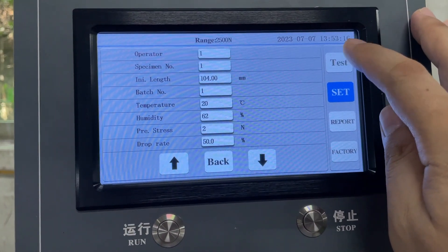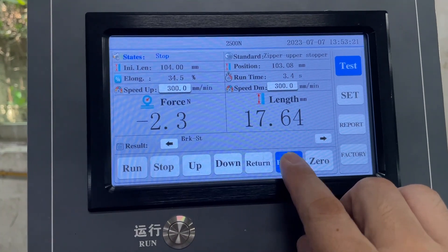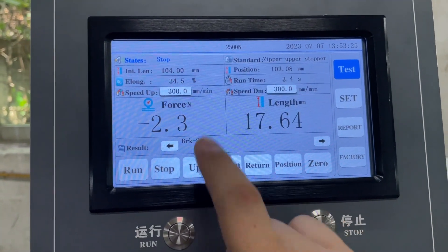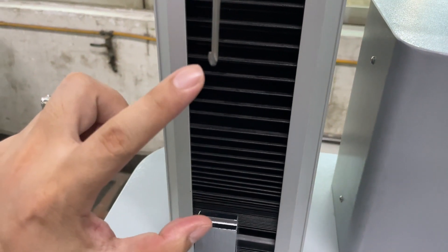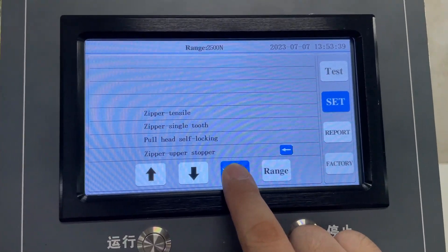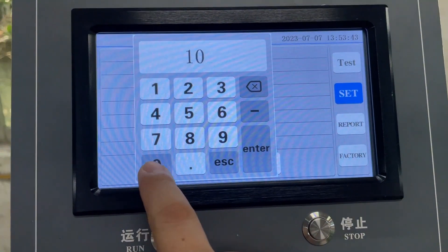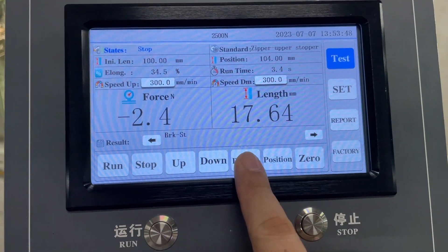Go back to the test. Press 'Position' — do you want to reset the location? Yes. Now the initial length is 104, but for testing we need around 100, so press 'Set', press 'Enter', set 100, then press 'Test' and 'Return'.